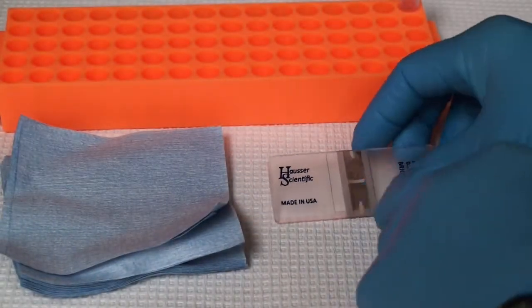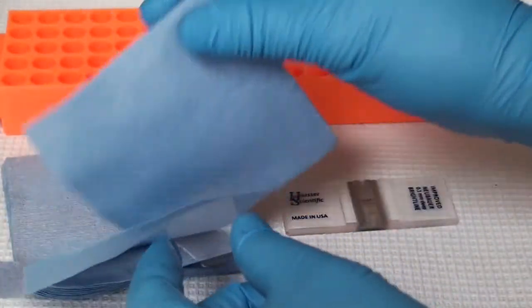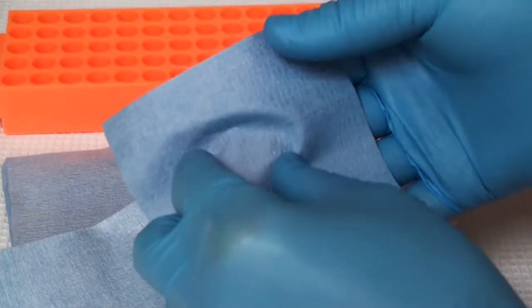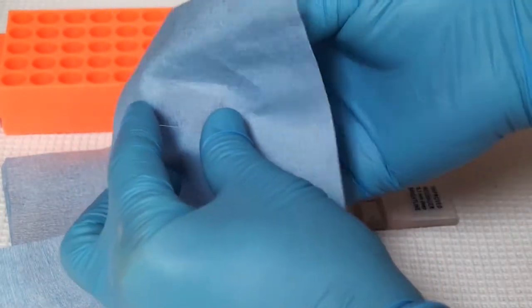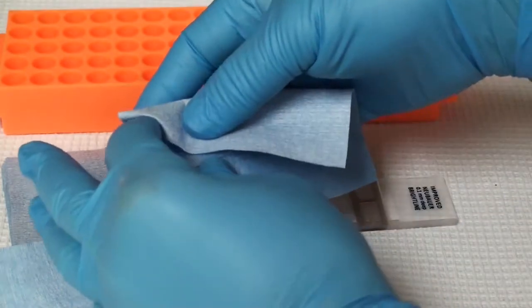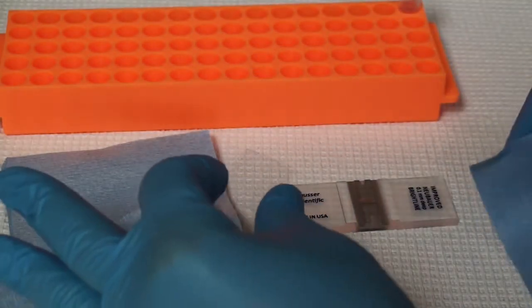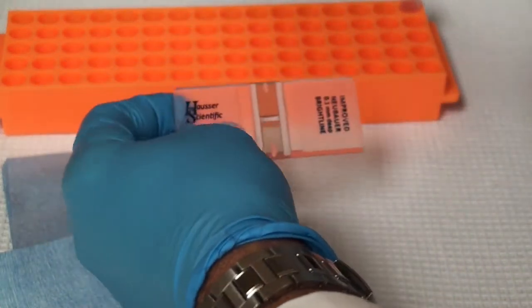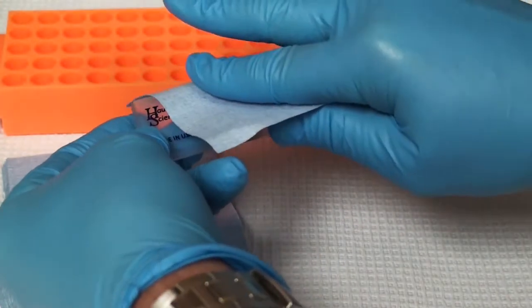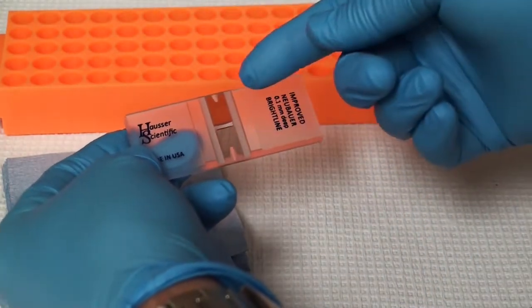As we do this, we want to make sure that our hemocytometer is cleaned before we start. Generally you're always going to want to clean it when you're done, but it never hurts to check. I'm using some lens cloth to just wipe it off. We do the coverslip and we want to do the same thing to the mirrored surfaces. Always use lint-free lens tissues or a very soft cloth — never use a hard paper cloth that can scratch the mirrored surface and leave scars.